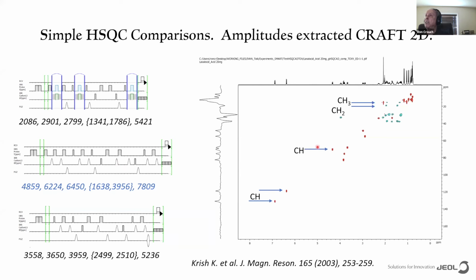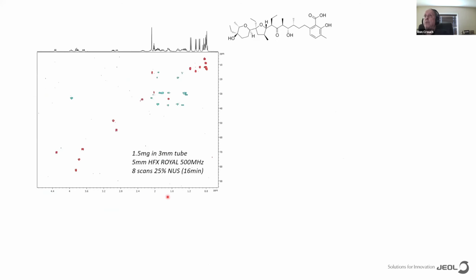So if we just look at these different cross peaks and compare, these are the amplitudes we get. And so we saw, wow, relative to simple HSQC, it really is a significant advantage in sensitivity to do this. And of course, we can do it with gradient coherence selection as well, P and N, and we do lose intensity there, but it isn't a sensitivity enhanced gradient. So this does win. So we can predict our experiment behavior.